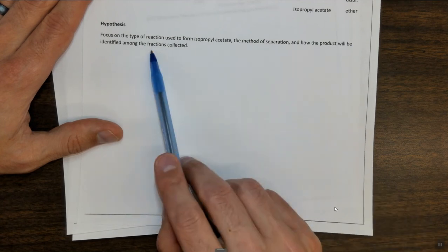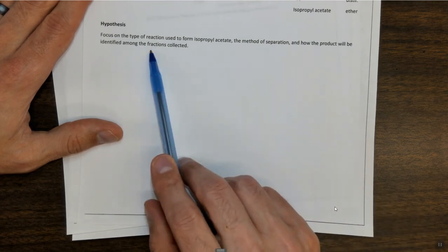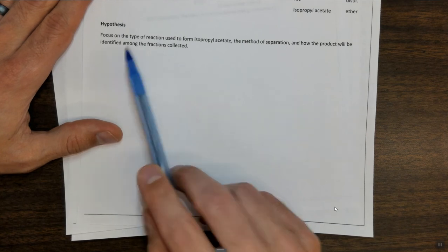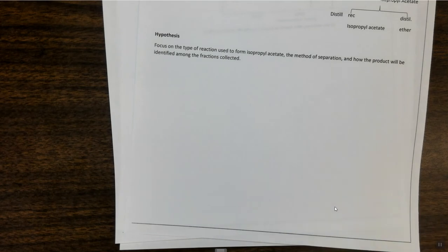In this case, we're going to identify it by boiling point, and we're going to confirm our suspicions by doing an IR spectrum and determining that it is no longer isopropanol. Also acetic acid, but the boiling point is so different there that you're probably not going to have a question of which one it is based on the boiling point. Between isopropanol and isopropyl acetate, the boiling point is only 4 or 5 degrees different, so there's a little bit of a question. Acetic acid is well over 100, so there's not much question there.